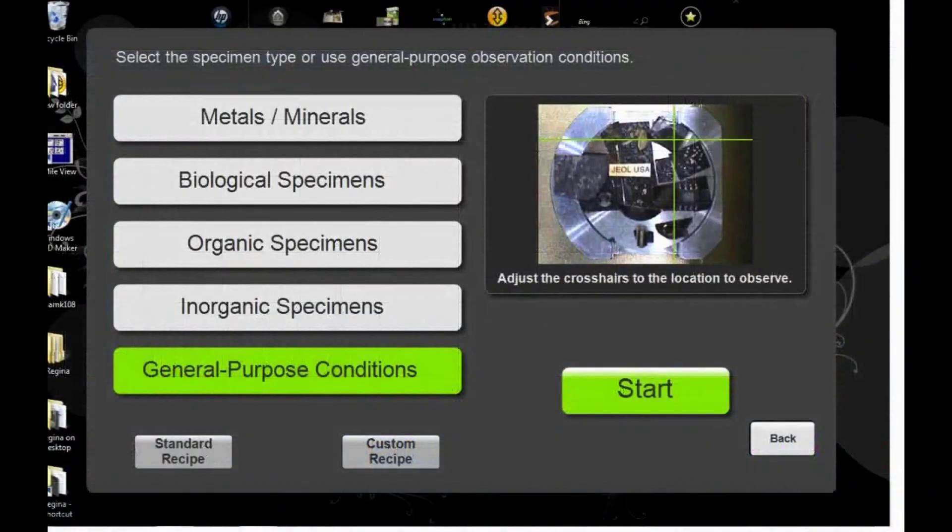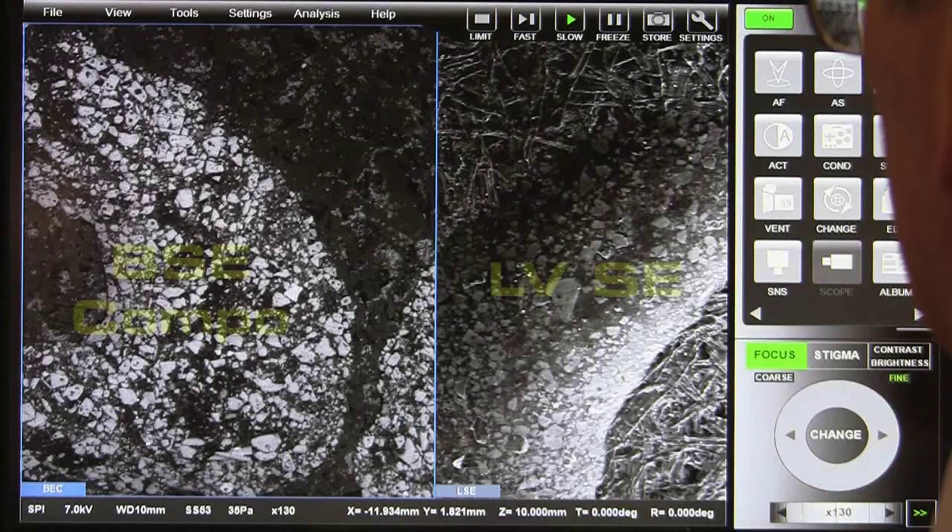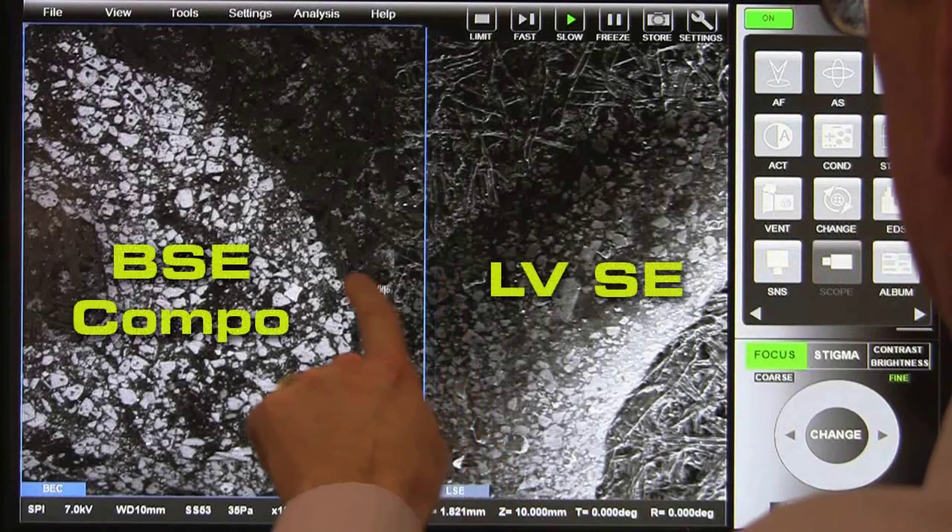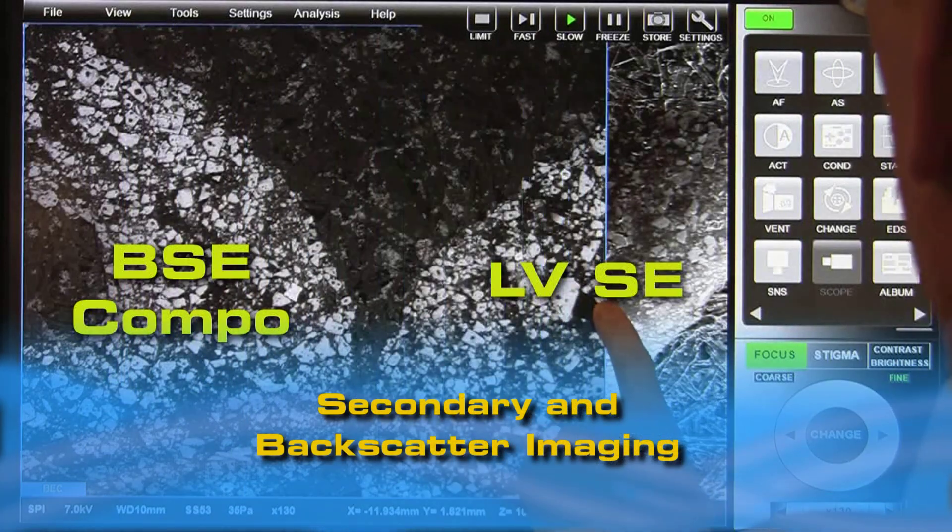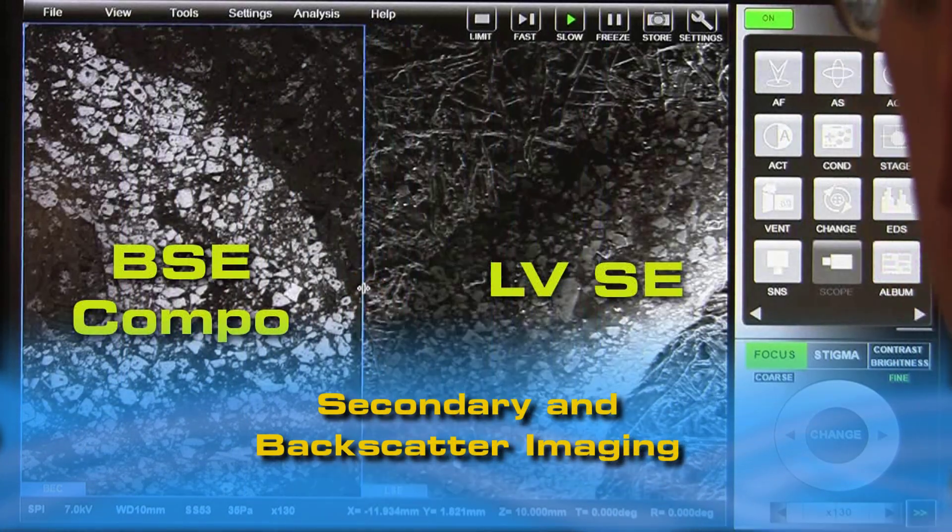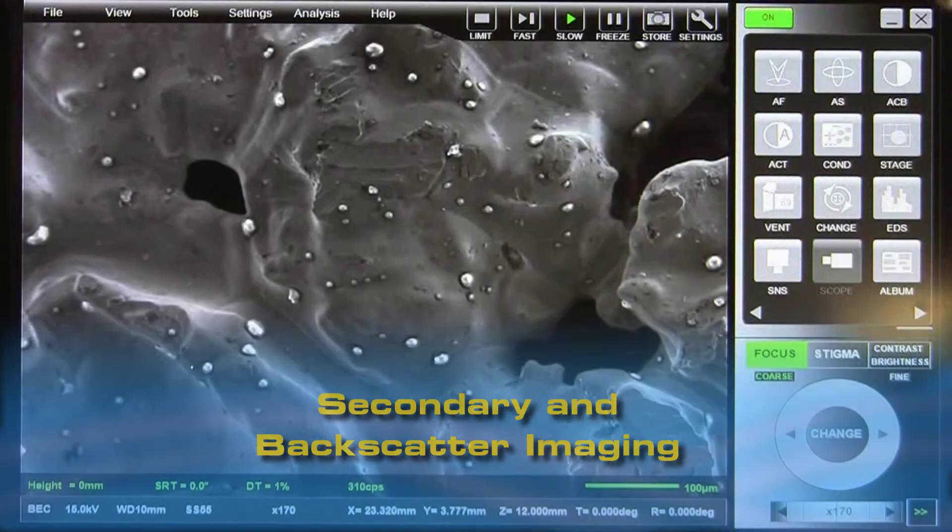Operating parameters can be saved in a recipe and recalled for future use. The InTouchScope secondary detector allows fine imaging of topography, while the backscatter detector clarifies compositional differences. The user can easily compare images on screen.